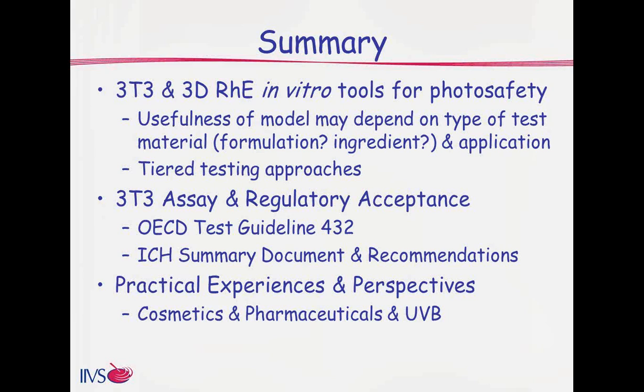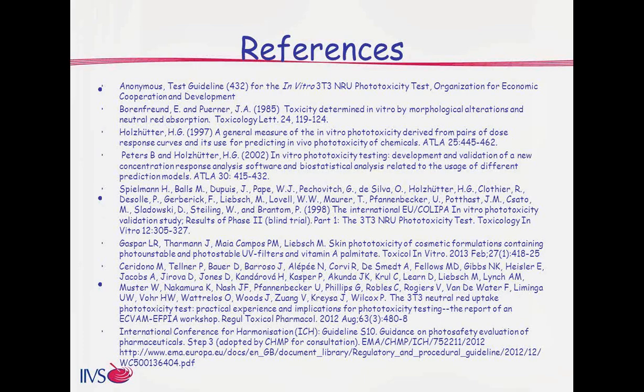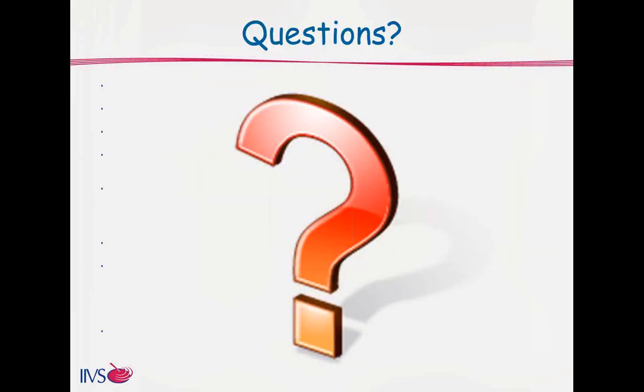He also talked about possible recommendations moving forward and comments on the statements recently released by the ICH. As Manfred discussed, one of the biggest concerns with this assay is its overprediction potential, especially from a pharmaceutical perspective. Yes, this assay is a sensitive assay, but it can give us a high level of confidence in our negative results. We have a number of references available.